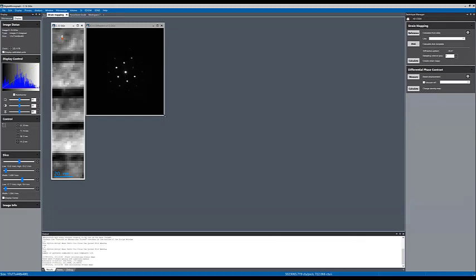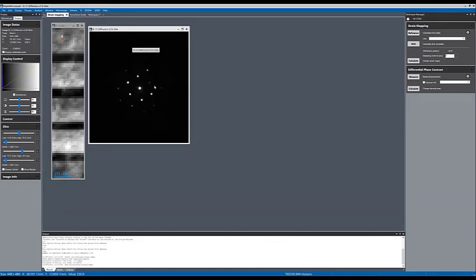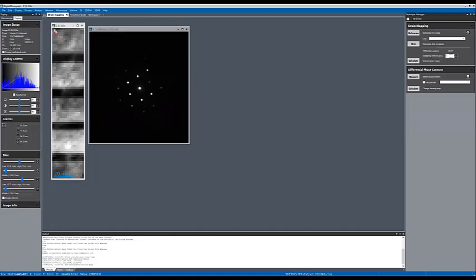But depending on the magnification and how STEM is set up on your microscope, and whether you have descan on or not, you might see quite large movements of this direct beam as you move the picker tool from one region of the data set to the other. If you collect the data set and then go offline and see that in your data set, before doing the strain mapping, it is better to take that out.